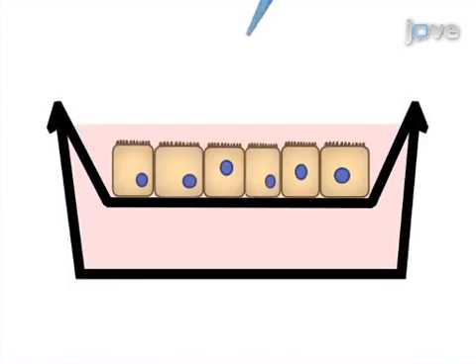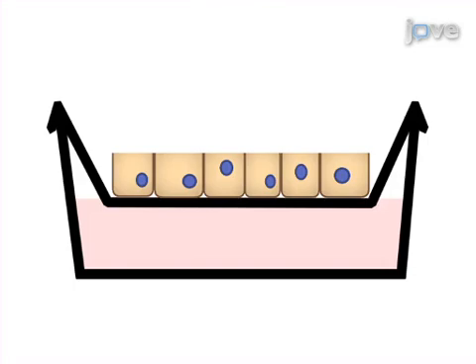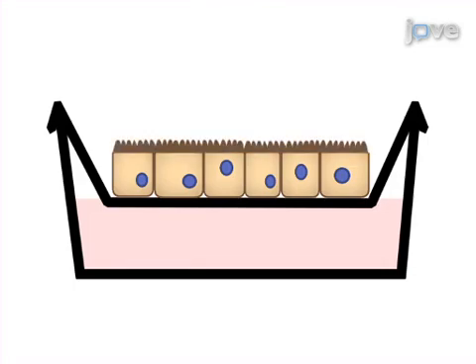The final step is to remove the apical tissue culture medium of the confluent cell cultures on the transwells to establish air-liquid interface culture conditions. Ultimately, cells grown at the air-liquid interface for three to four weeks will redifferentiate into a mucociliary nasal epithelial cell culture, mimicking the phenotype of the nasal epithelium in vivo.